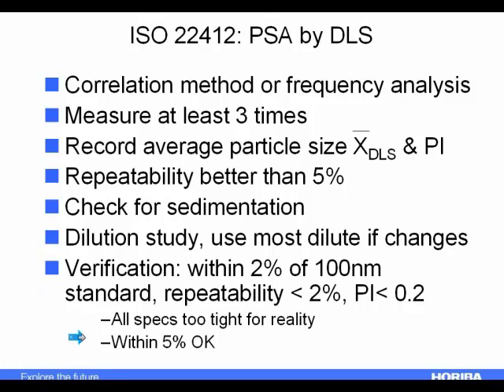And as far as I'm concerned, if you're using DLS on a typical day, and I'm using a PSL, if you're within 5%, I think that your instrument is probably just fine, and you're probably just dealing with sample preparation, salt concentration, things like that. And on a day-to-day test, and even something more rigorous, I would say that the values in the ISO document are probably a bit tight.